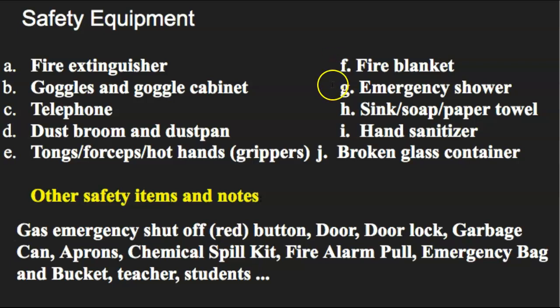The emergency shower. This is what we use to wash out our eyes or to wash chemicals off body parts if we get them on them. Now realize this will be a painful experience, as you have to hold your eye open wide while you're flushing water across your eye from your nose out to your ear. Not a pleasant situation.